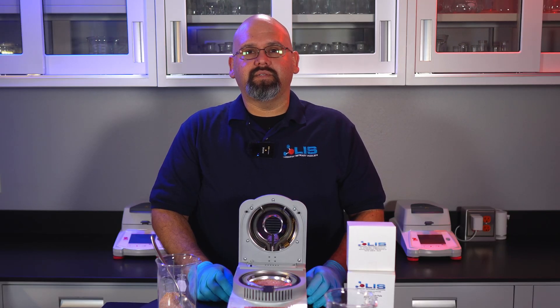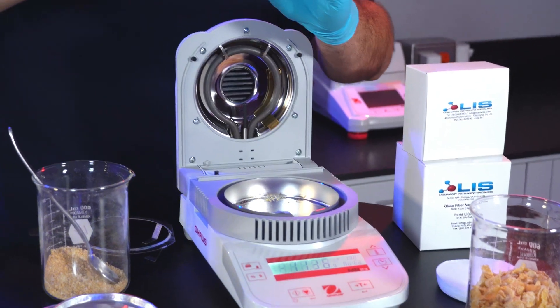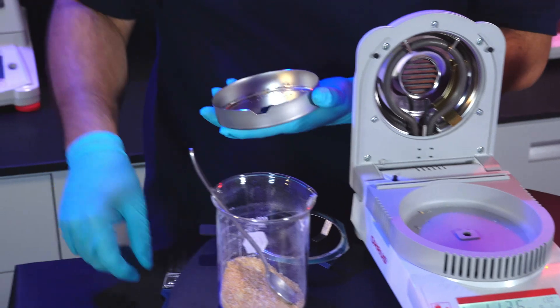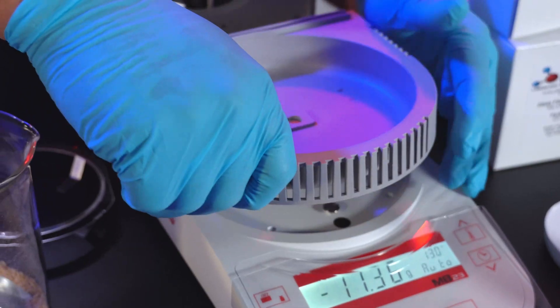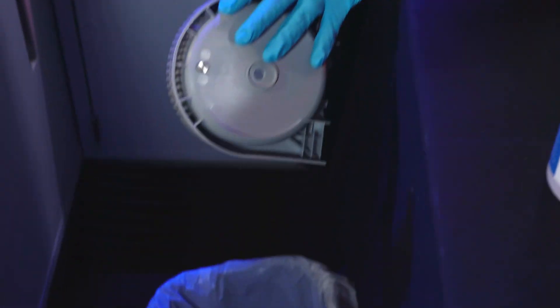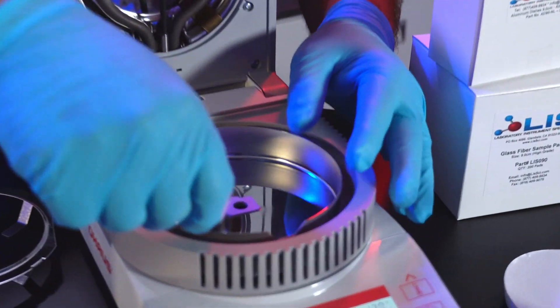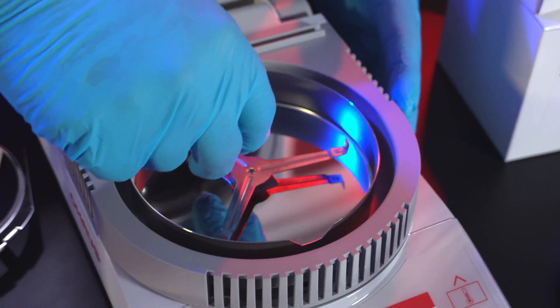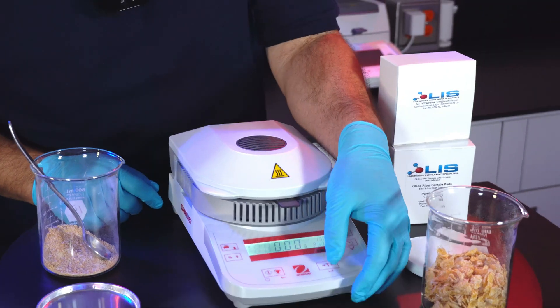To achieve the best performance, it is best to clean out the instrument in between tests. Remove and dispose of your sample over the pan holder. Remove the air shield. Using a brush, clean out the air shield. You can also remove the chamber by pulling it out and clean. Insert it back in. Apply a new dish. Close the lid and press tear.